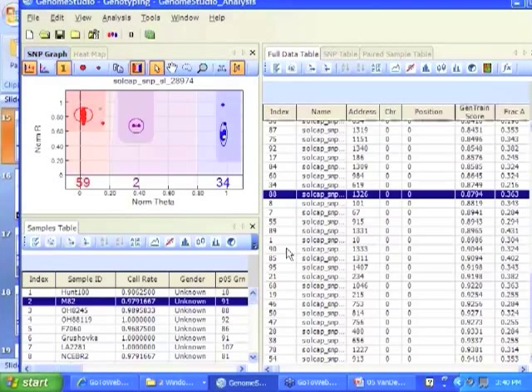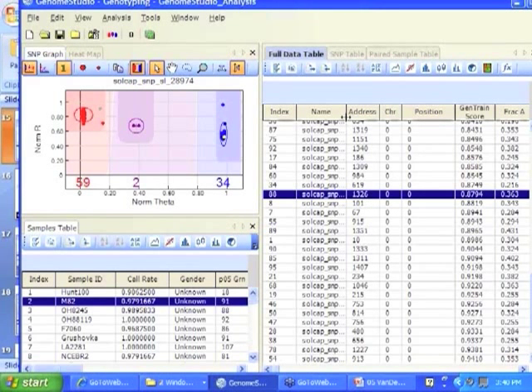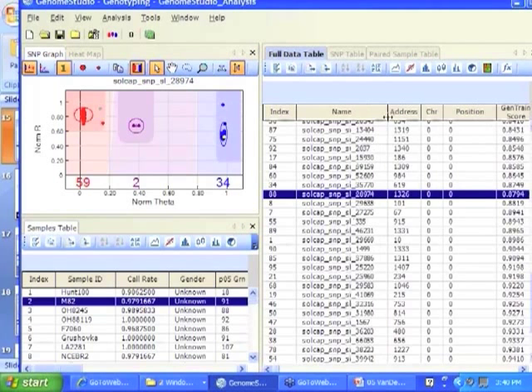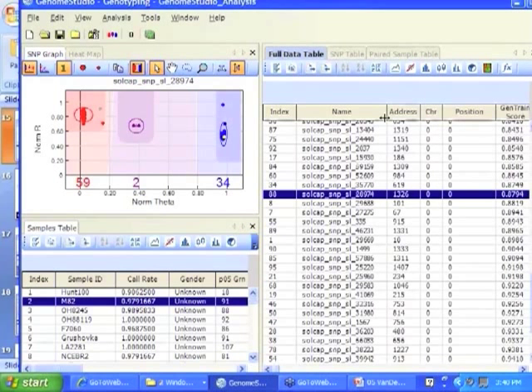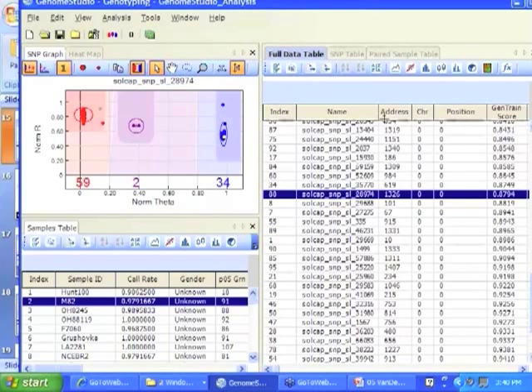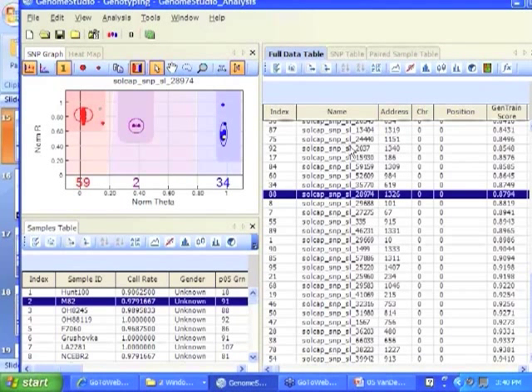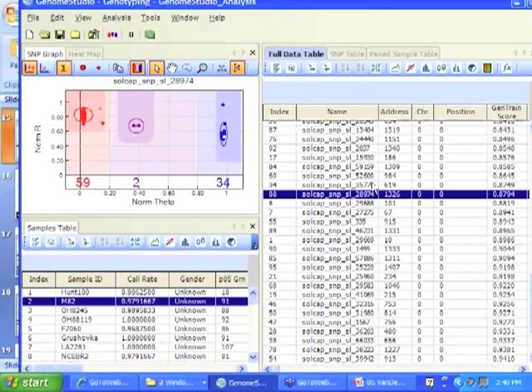This is where you can start manipulating data. You have basically SNPs on the right. So these are the SNPs and the SNPs names. So if I expand this, this is what Solcap has called their SNPs. These represent positions, so Solcap SNP, Solanum Lycopersicum and then a number for the different names.